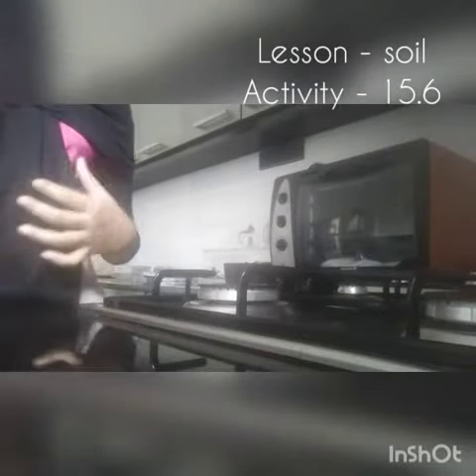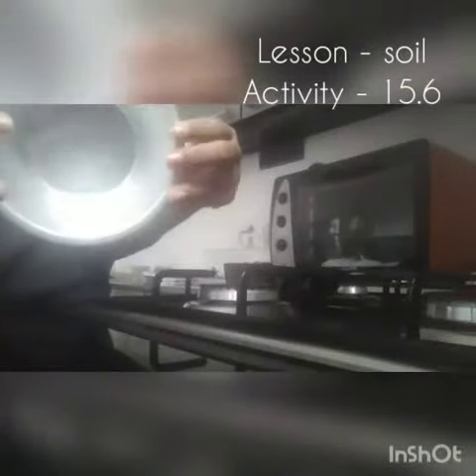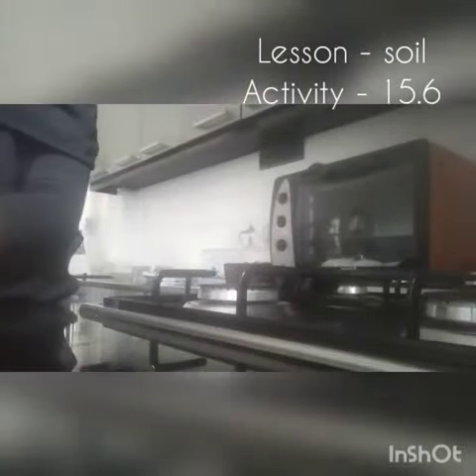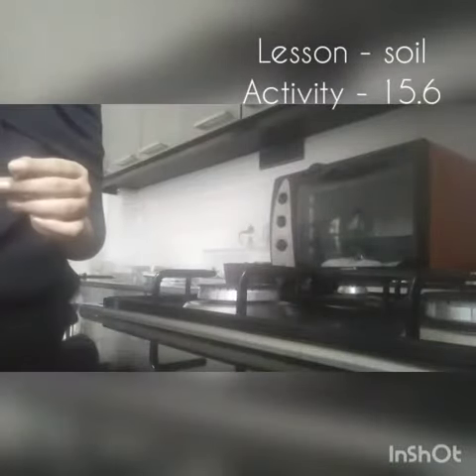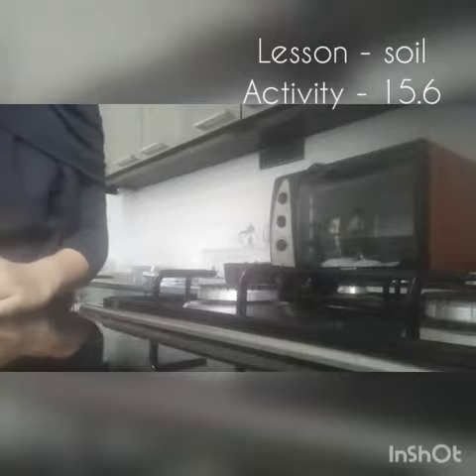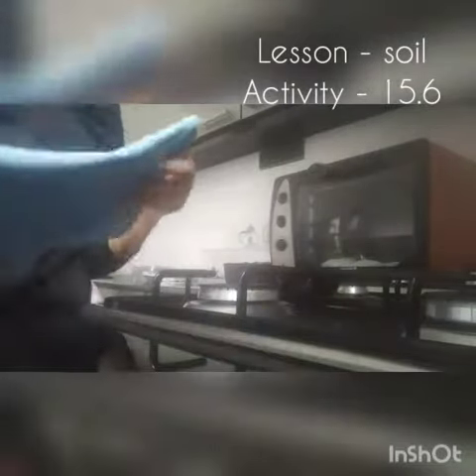You need a test tube or container. If you are using a test tube, you don't need a lid. If you are using a container, you need a lid. You also need a bunsen burner or a spirit lamp. I'm using a container, so I need a handkerchief.